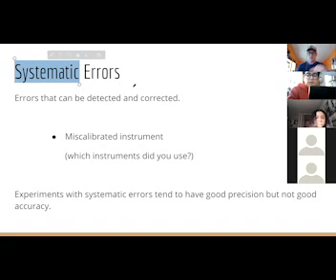Isn't it kind of like you're setting it to a standard so that everyone's measuring it by the same thing? Kind of like when you tare the balance. It's not quite like taring the balance, but your first part was absolutely correct. It's like setting a standard so that you know what you're measuring is accurate.